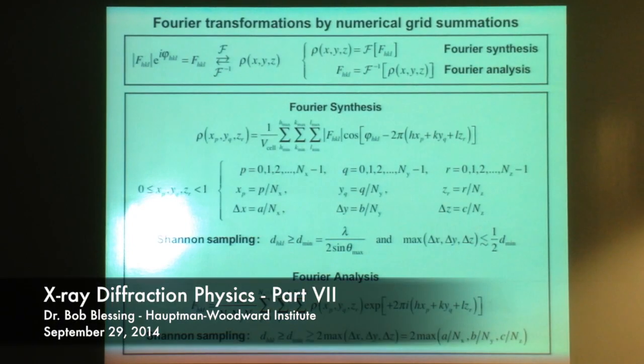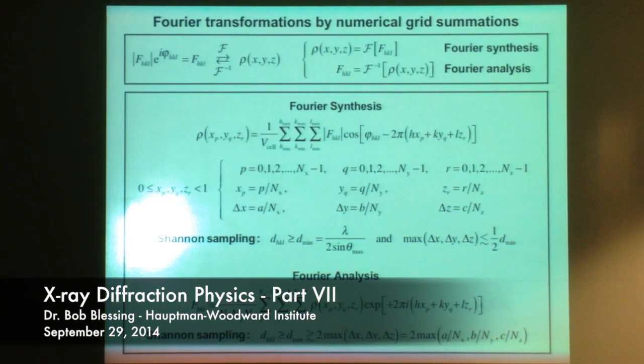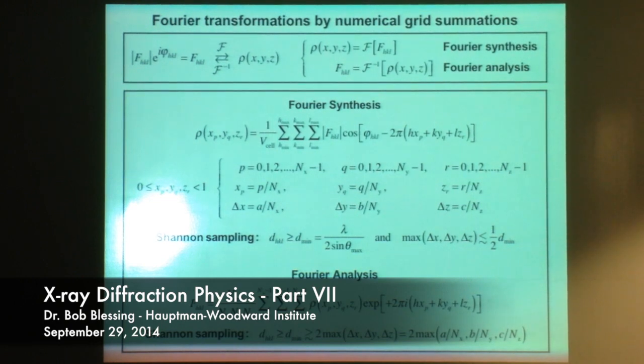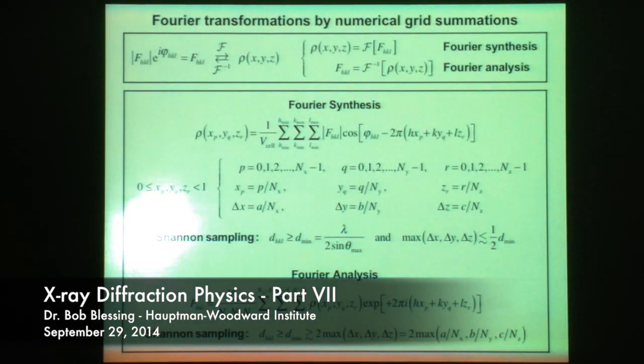Okay, so when we were last together on Friday, also without the screen, we had been talking about the actual numerical calculation of electron density maps or of structure factors from a known structural model or a given electron density map. And so this is what we had looked at briefly.